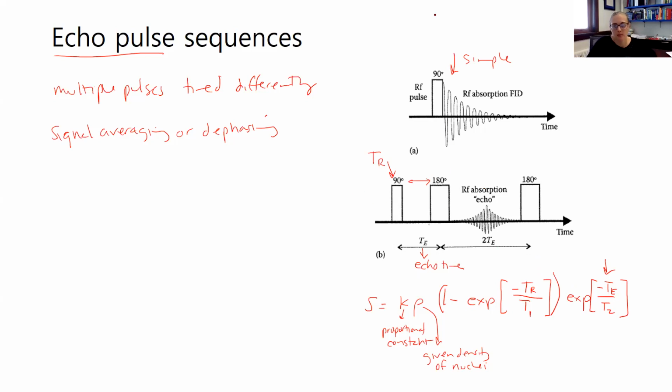So realize that using different echo pulse sequences can improve and change your sensitivity in a more specialized form of running your NMR. So that's just another mention of, I guess this relates to, on the previous slide, the radio frequency excitation, that it can be specialized with different forms to relate to that Fourier transform. So that's a little bit more detail about that setup.